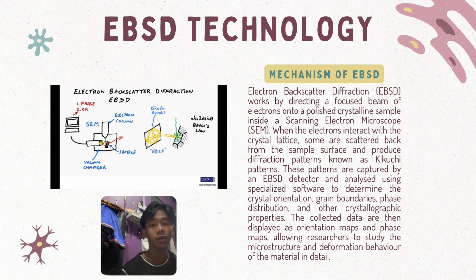These patterns are captured by an EBSD detector and analyzed using software to map out crystal orientation and grain boundaries in high detail.